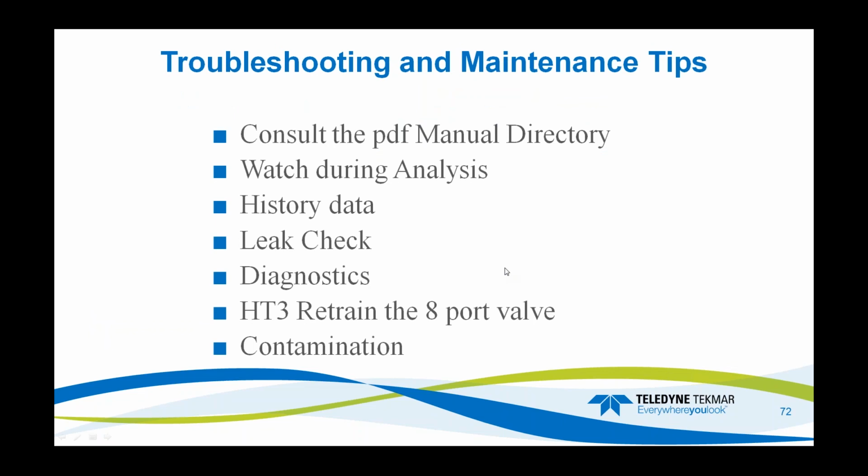Now that we've covered methods to work with, I want to cover a little bit of troubleshooting and maintenance tips. The first thing you want to do is consult the PDFs in the manual directories. Then you want to watch during analysis. There's history data we want to look at, perform a leak check, and do diagnostics.